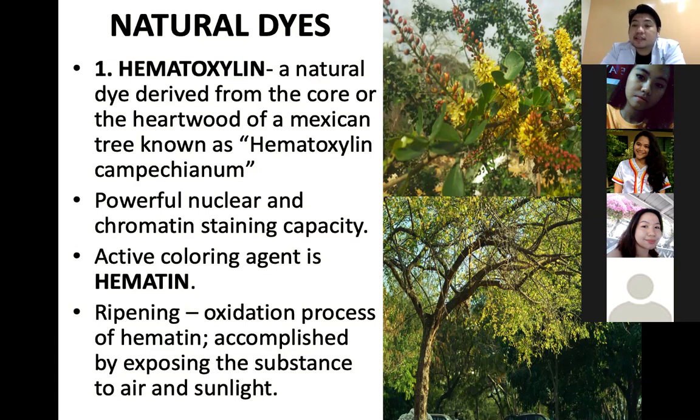This is natural ripening: exposing the dye to air and sunlight, but it takes a long time to ripen the stain. What we do now is synthetic ripening, where we add chemicals to oxidize our stains. Natural ripening is no longer used.